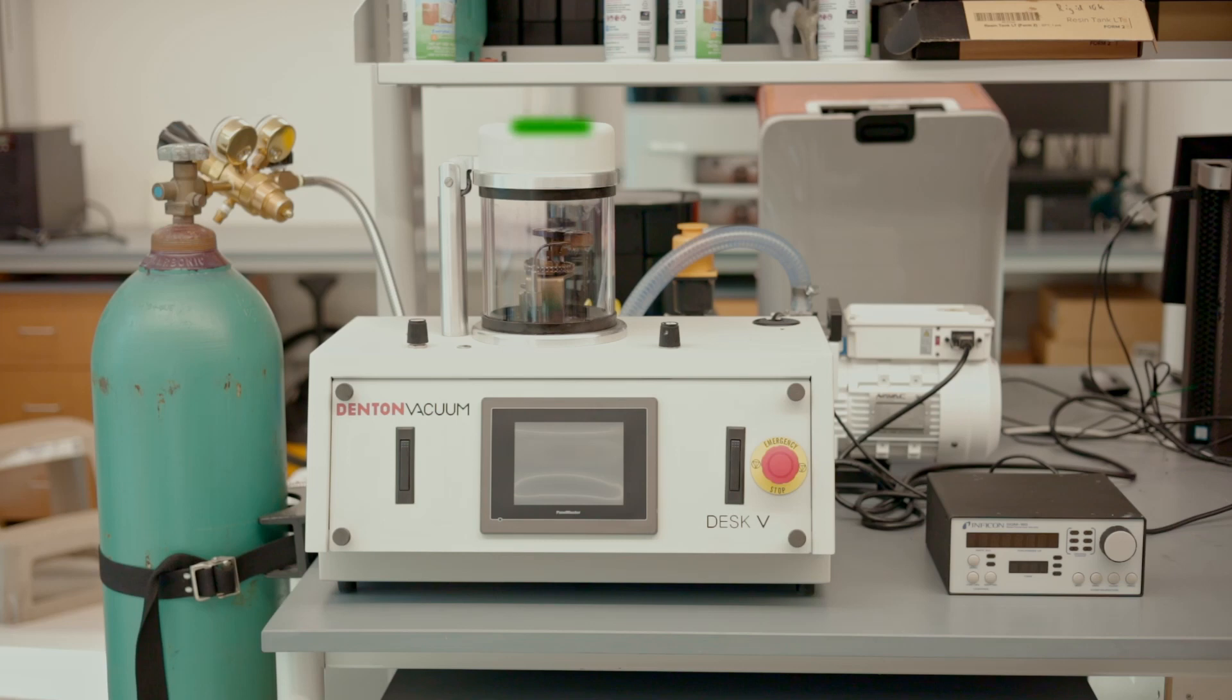The sputter coater has a vacuum chamber where we load the samples, a touch display, and an emergency stop. Use the emergency stop during any step of the coating process to stop the equipment and prevent any damage to the sputter coater, the samples, or the surroundings.